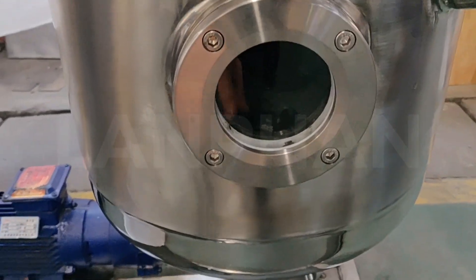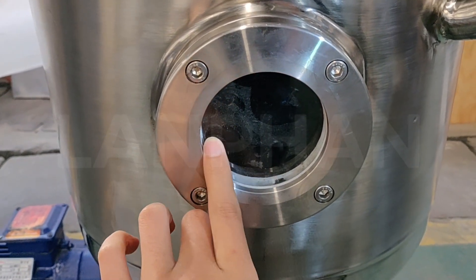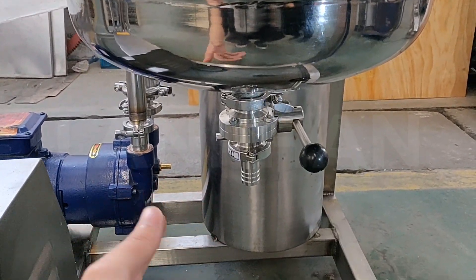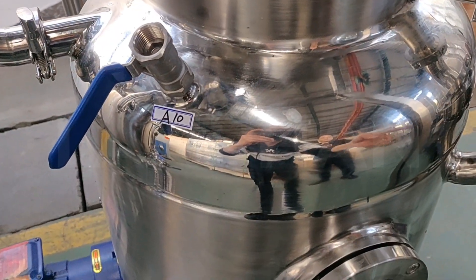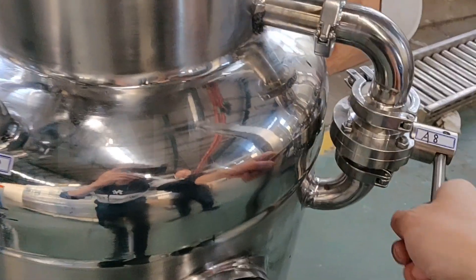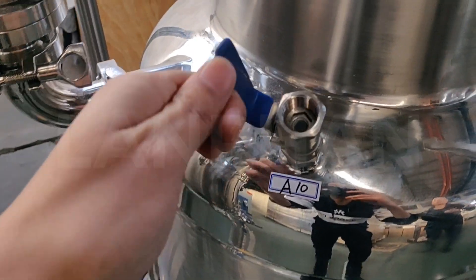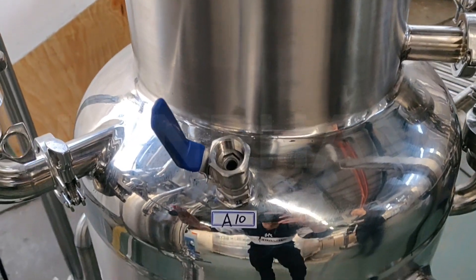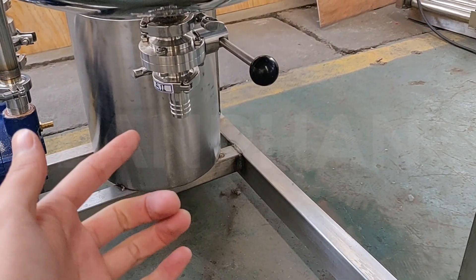Please pay attention to the window. When the liquid comes to the middle of the glass, we need to discharge the solvent from the bottom. First, we need to close this valve, and then we open this valve for pressure release. After pressure release, we can discharge the solvent from this port.